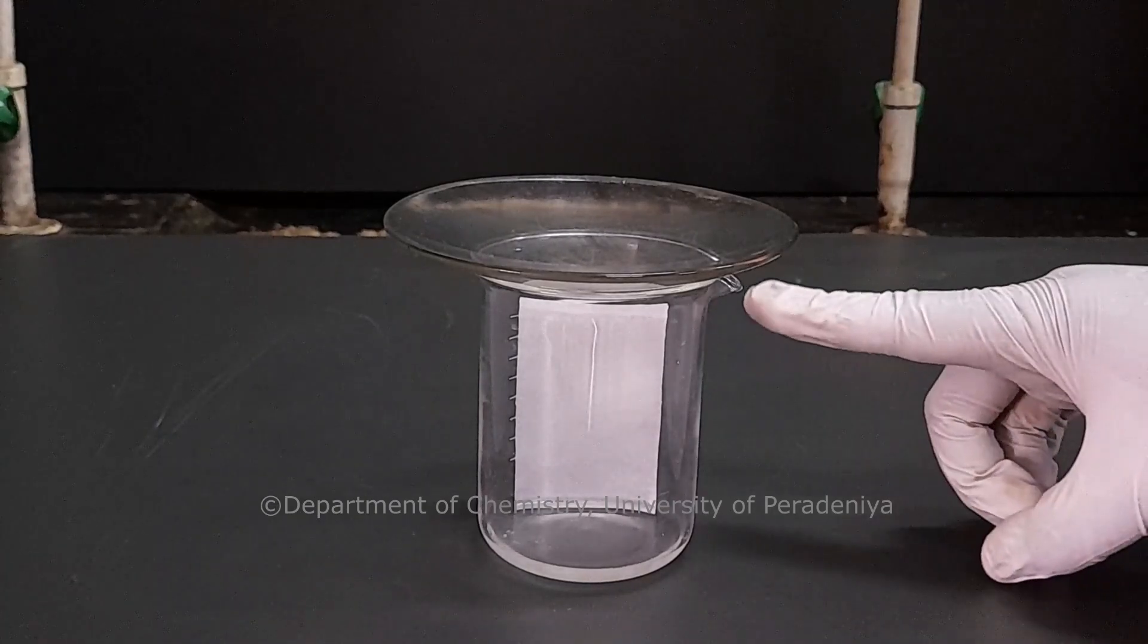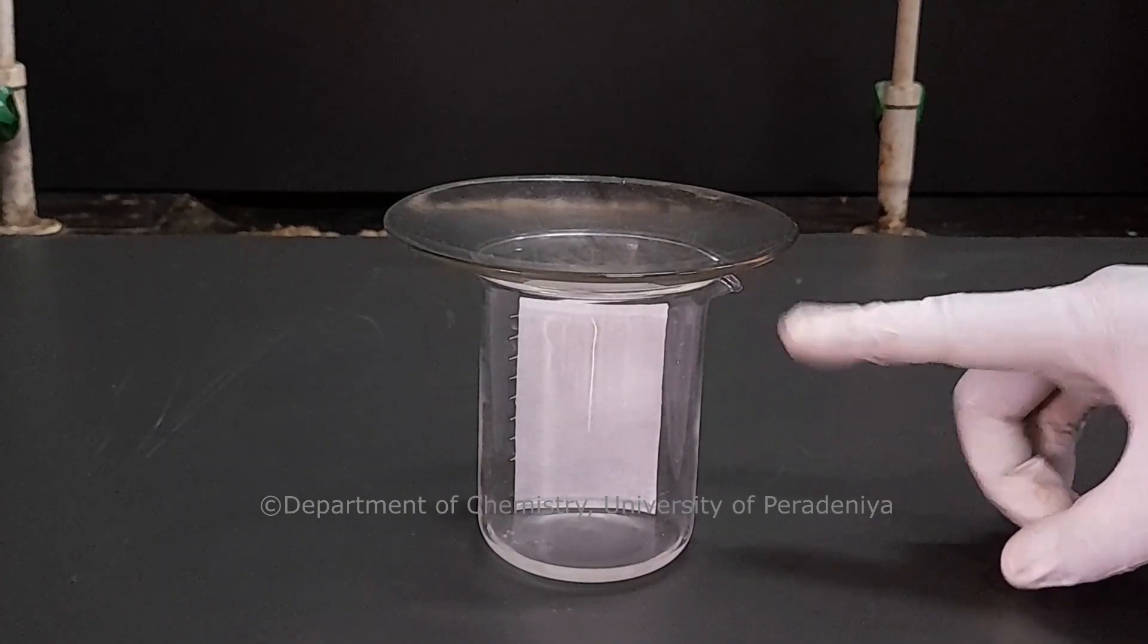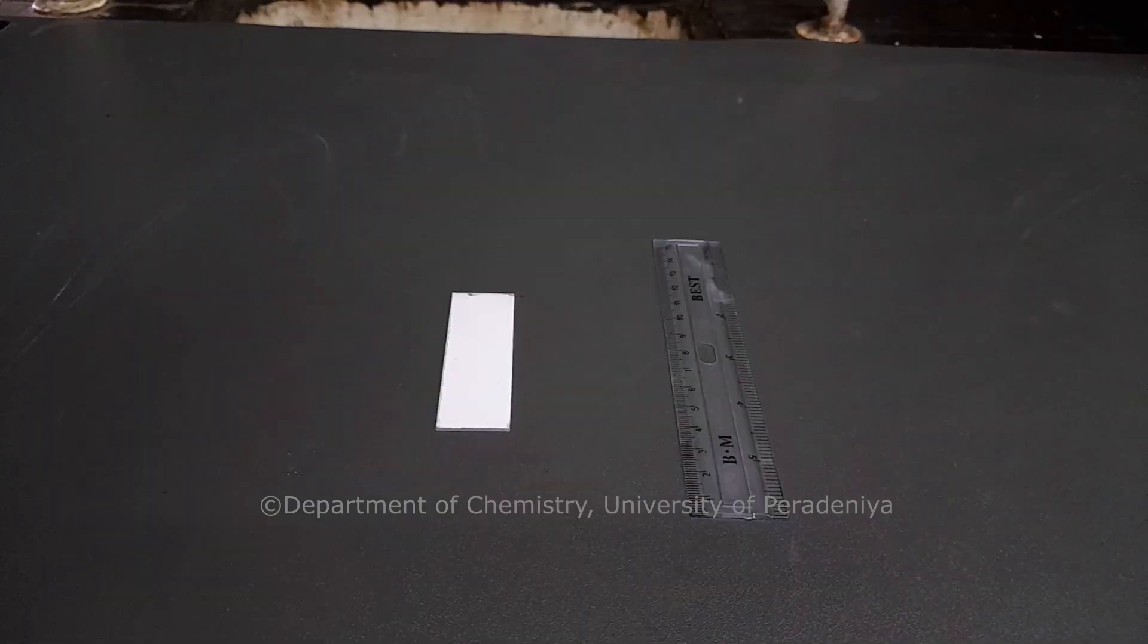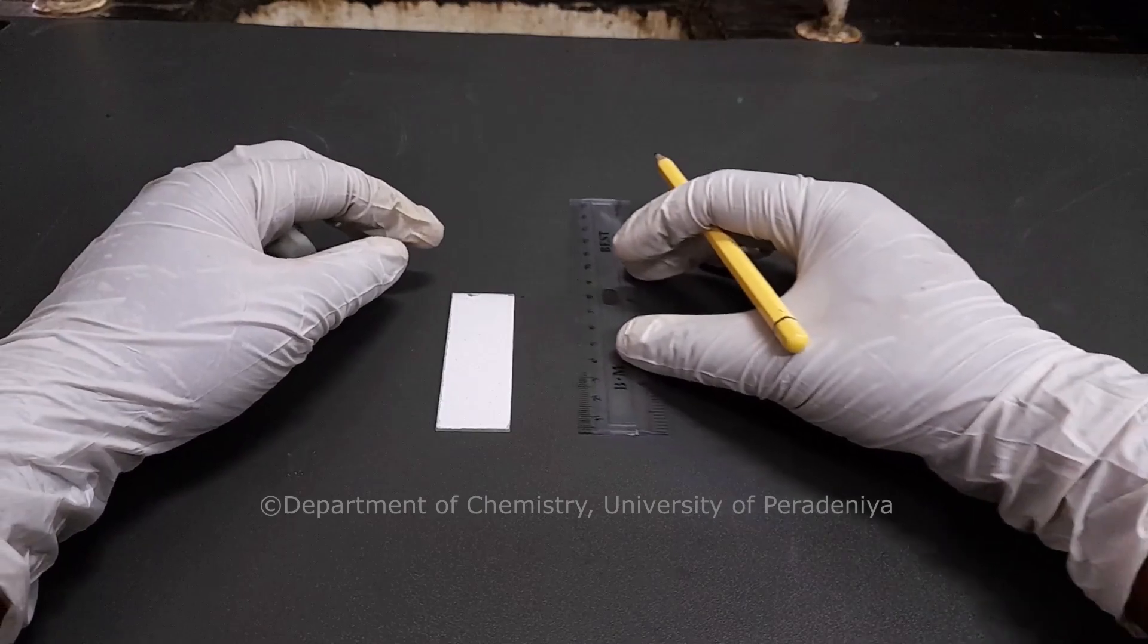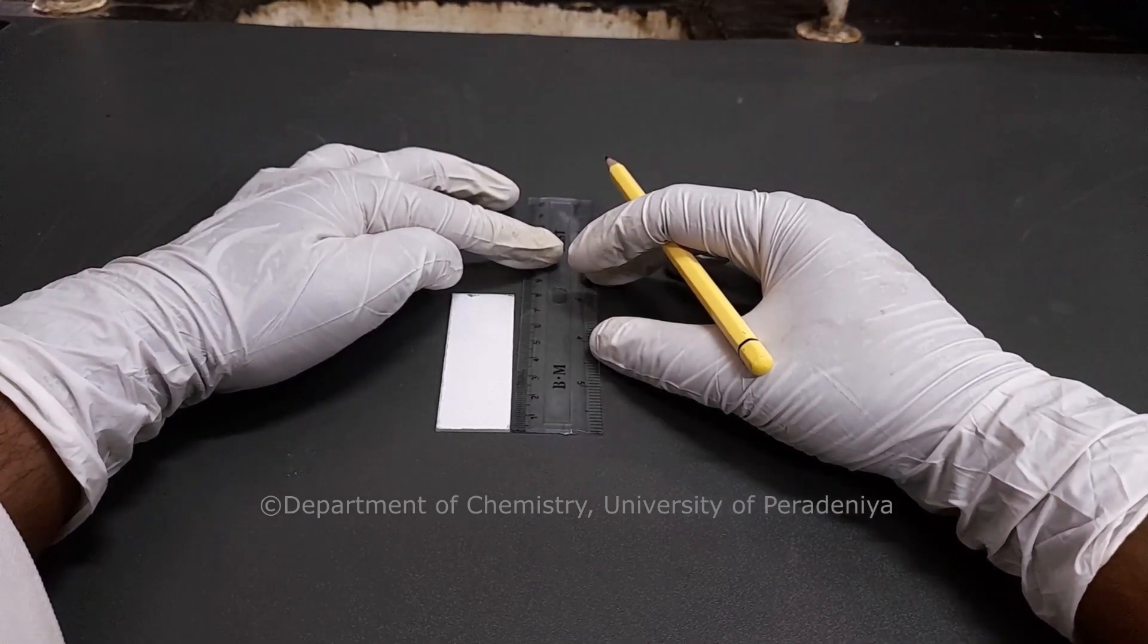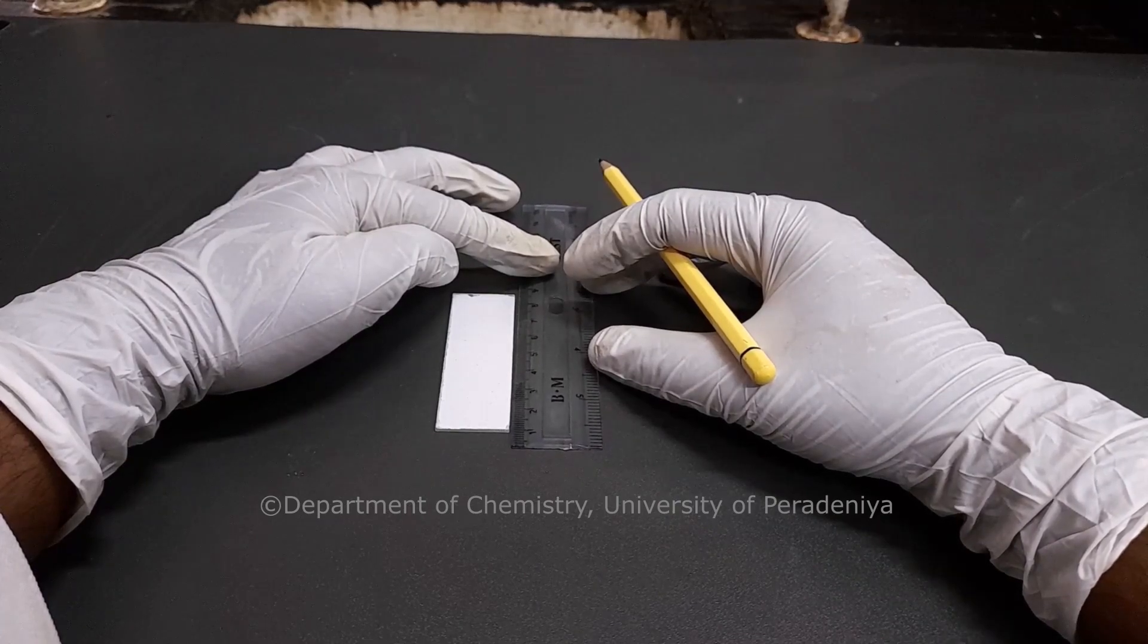Now the chamber is saturated. A ruler is used to mark the baseline and the solvent front on the TLC plate, or else a line can be drawn by using a pencil without damaging the plate.